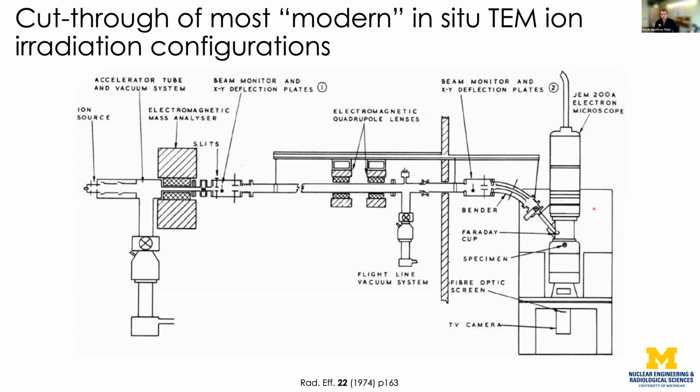And we now typically use an ion accelerator or some type of source in order to generate an ion. The most common ones that you would see nowadays are primarily gases, so xenon, krypton, argon, those types of ones, because they tend to be very stable sources. You would then accelerate this down a beamline.